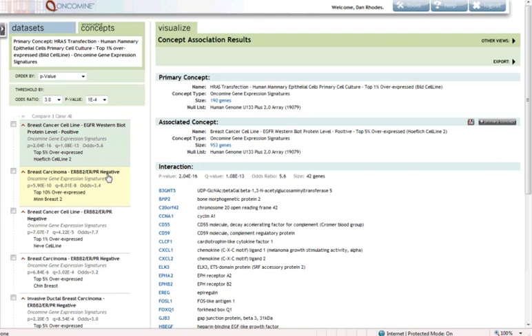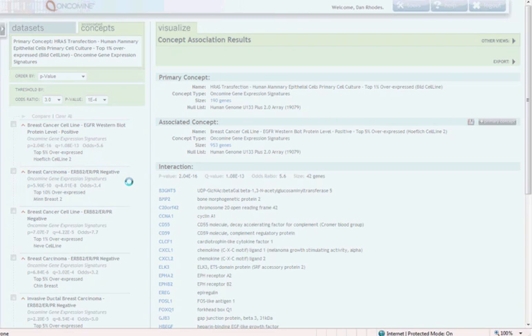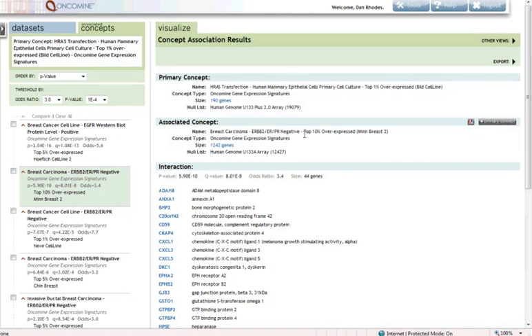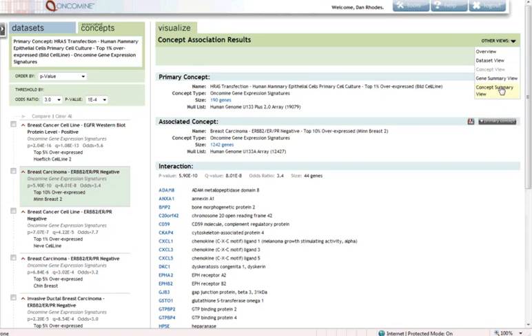That's something that's consistent with published literature, that this subpopulation of breast cancers disproportionately overexpresses the RAS-MAP-K axis. And if we wanted to, again, we could drill down and visualize this association simply by clicking the heat map.